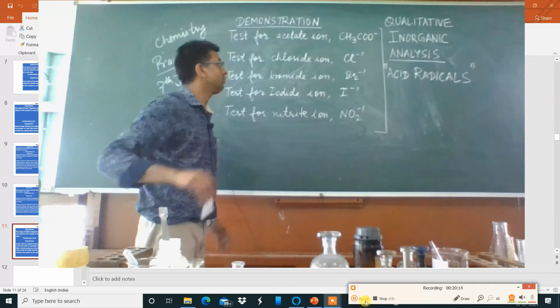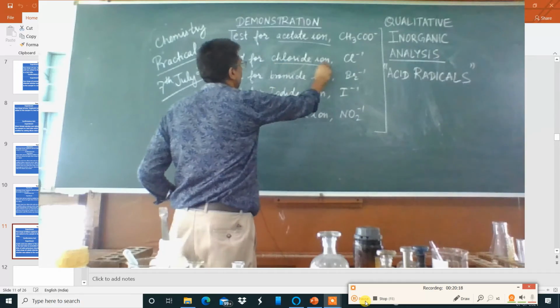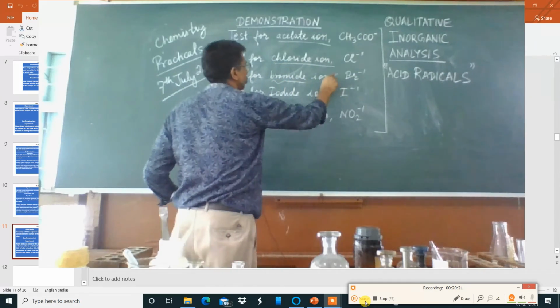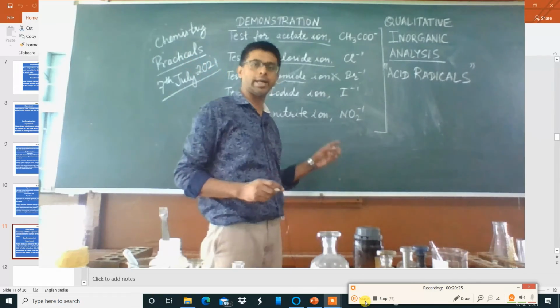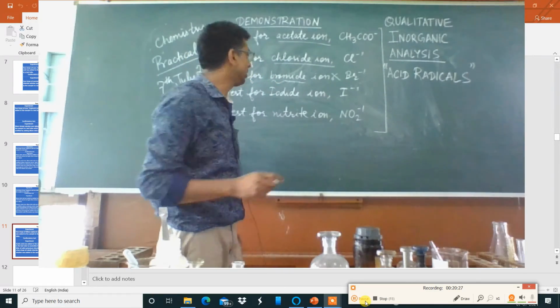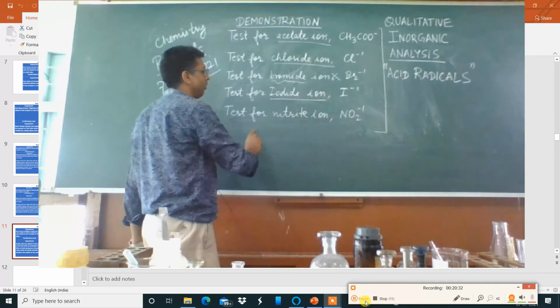So today I have shown you the test for acetate ion and chloride ion. Bromide I could not show because of the poisonous bromine vapors and unavailability of reagents. And after that I have shown you the test for iodide ion and the test for nitrite ion as well.